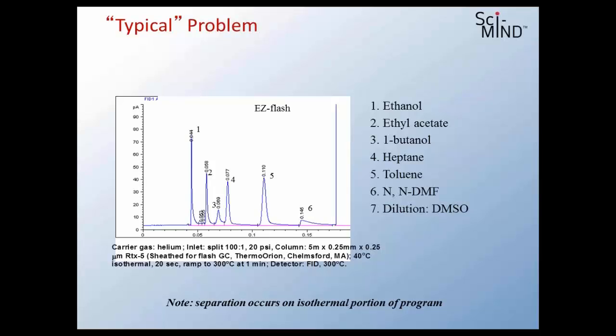Okay, I can't inject with Headspace, or really there's no point in doing Headspace analysis because the Headspace extraction is so slow that a 9-second separation doesn't buy you any benefit. So I have to inject differently. In fact, I have to do a very fast injection to make this work. So that's a little different, kind of takes away from my ease of use, takes away from my sample capacity. I have to do a fast split injection instead of doing a nice, slow, steady Headspace injection.